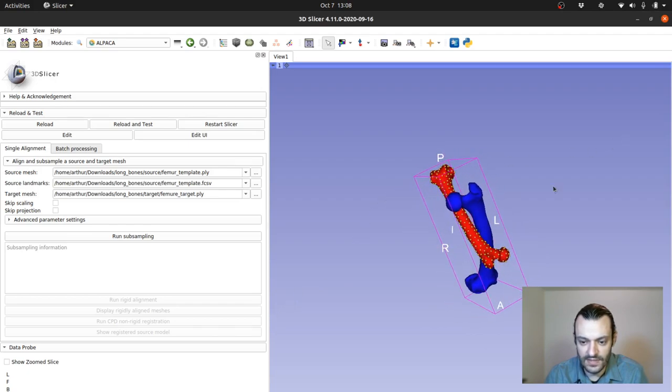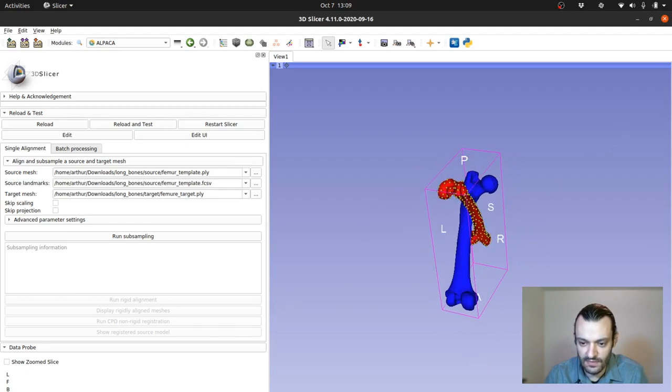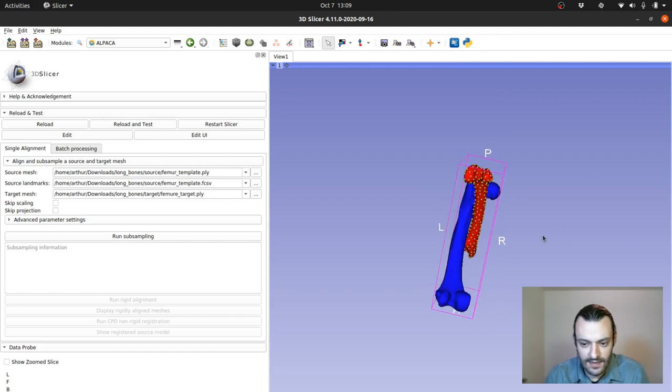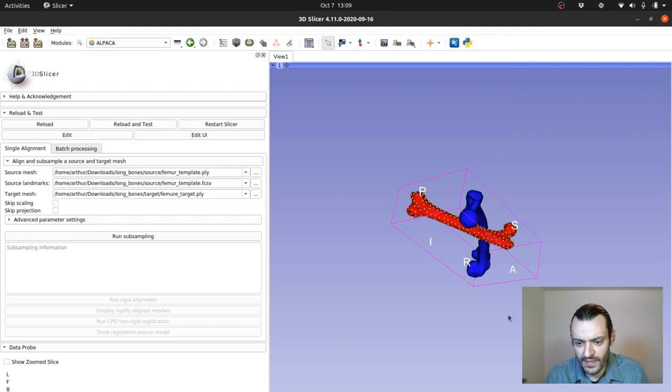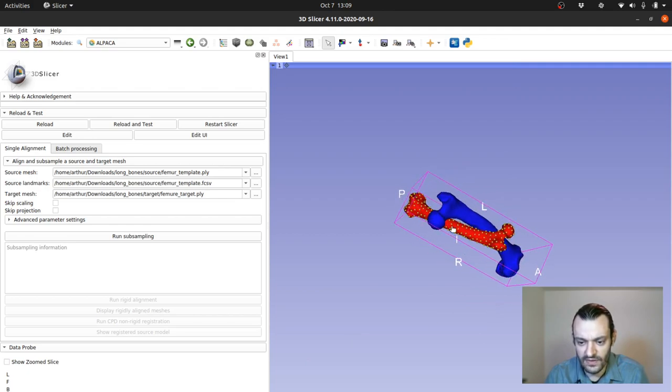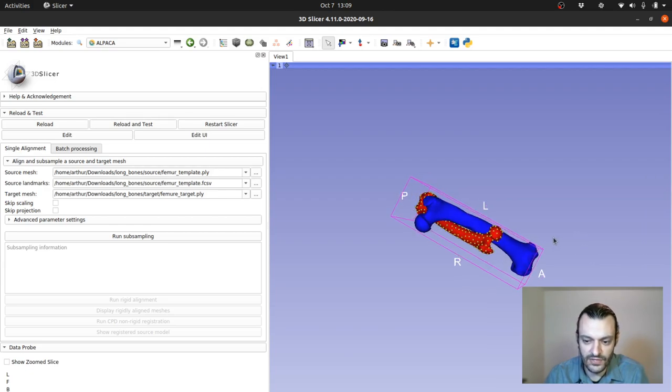And as you can see, there's a big difference in size between them. The male gorilla femur is much larger than the female. Let's say that we're using the female femur as a template from which we want to transfer the landmark positions that we've collected in this female mesh to the male one.